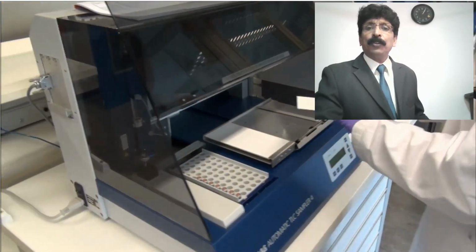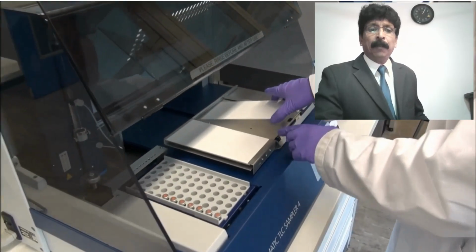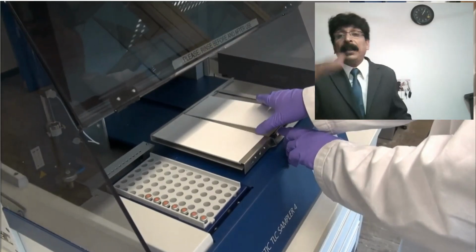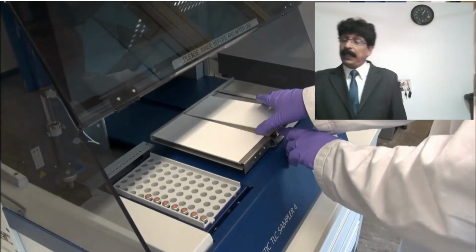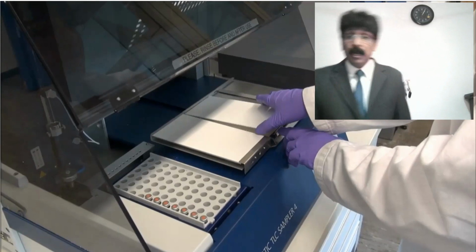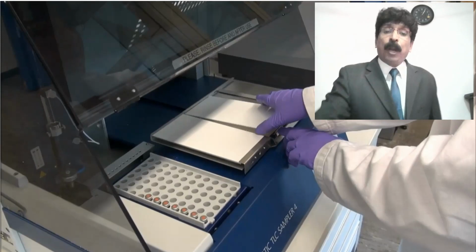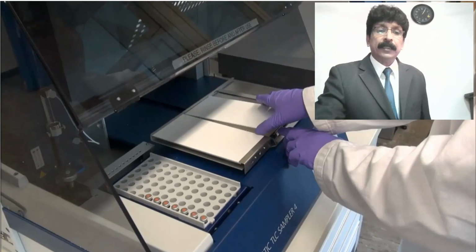You are going to do sampling, fixing, sampling. See, for sampling you have to keep the vial in the sampling area. Already you have kept that vial, the sample which we want to spot over here, and then you kept it here for sampling.